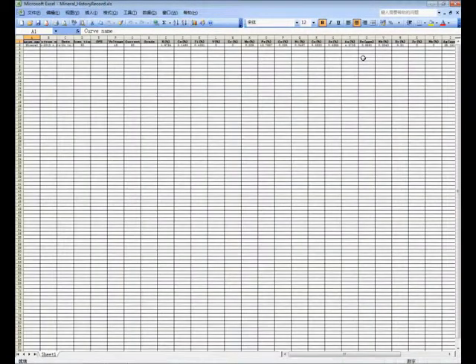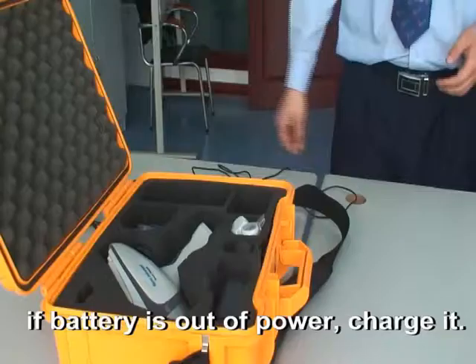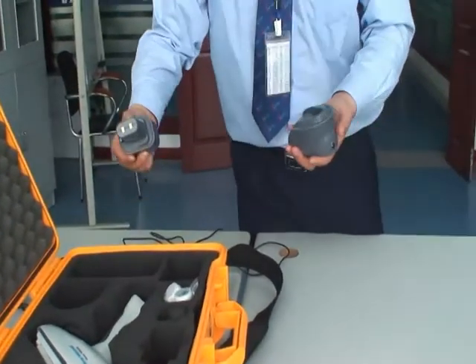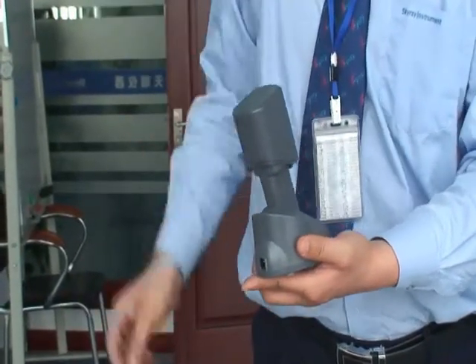To charge the battery, take out the charging device and battery. Insert the battery into the charging device, then connect the power adapter and plug it into a socket.